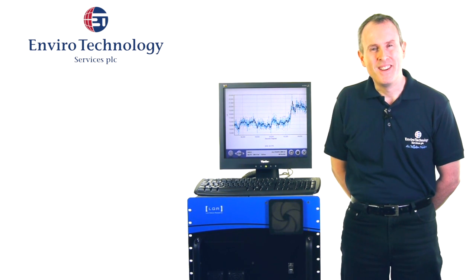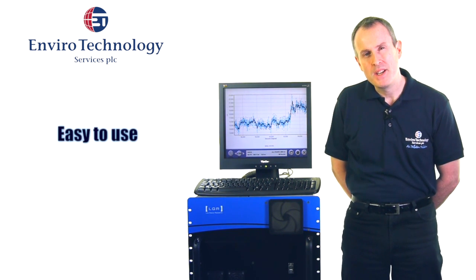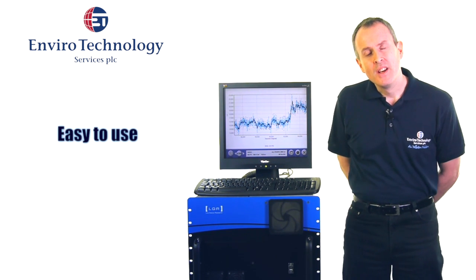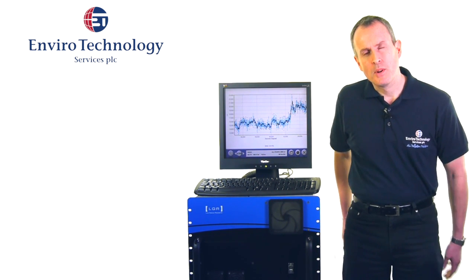It's extremely easy to use and that's one of its major advantages. Essentially the instrument can be taken into the field or into a laboratory.